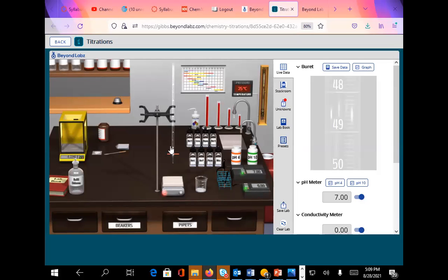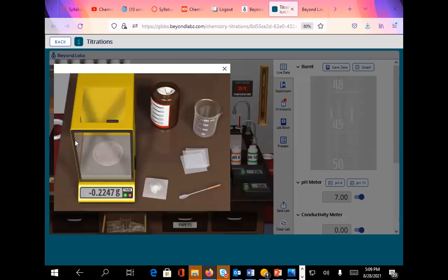So the worksheet tells us to click on the beaker drawer and to place a beaker in the spotlight next to the balance. Tells us to click on the balance area to zoom in. And then if this lid is on, you just click on the lid to take it off. You drag the beaker to the balance, and then you're going to want to tare the balance. Go over to the KHP and click. Now hold down and then bring your spatula over, and you have to find where it gets pulled up into place. It will pull it, there you go.